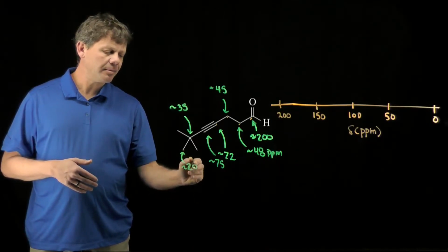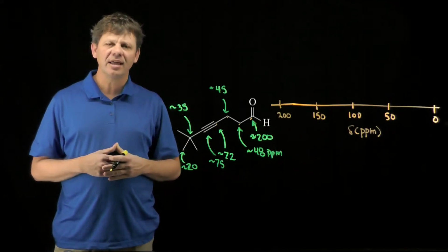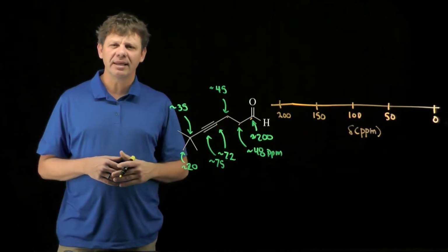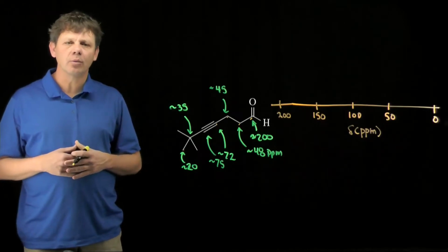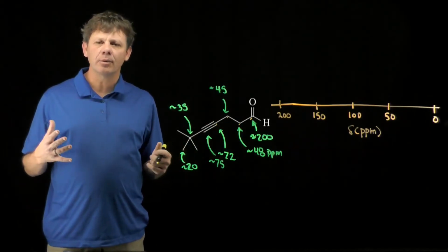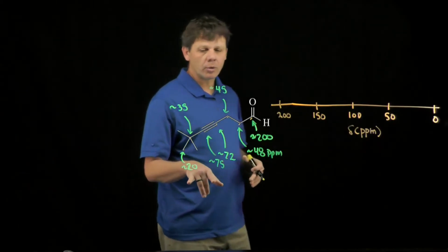Now, by the way, this same molecule, I think this was the topic of a previous assessment. If these numbers match the ones that Adam did in that video, fine, use those. The exact numbers aren't what really matters, just that we're getting them in the range, and that's really how we'll use C13.